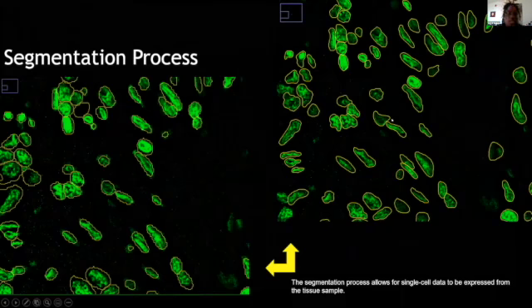So what segmentation is, before I go in and edit the segments, we receive a segmentation from a previous system, a computer algorithm that gives us these segments, and they're not always correct. So I will have to go in and edit these, and I will talk about the errors in the next slide, but that was what I was focused on for the duration of my internship.